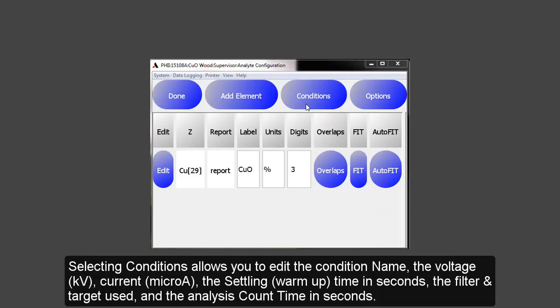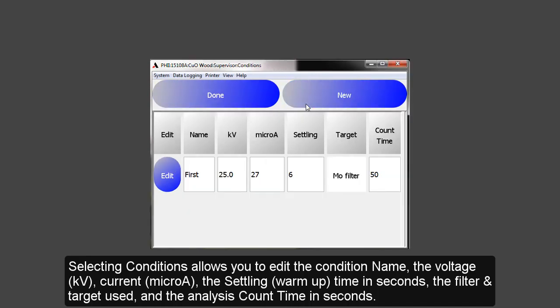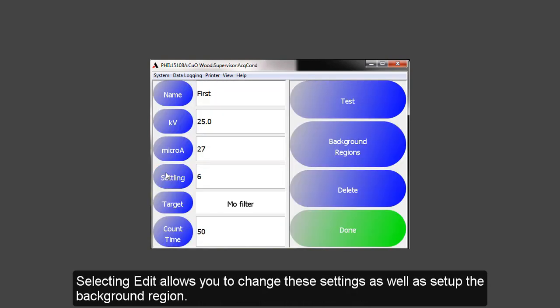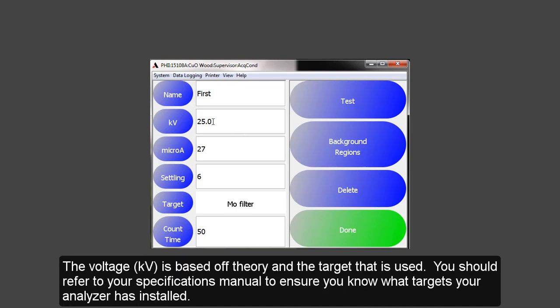Selecting Conditions allows you to edit the condition name, the voltage, the current or microamps, the settling, the filter or target used, and the analysis count time. Selecting Edit allows you to change these settings, as well as to set up a background region. The voltage, or kV, is based off theory in the target used.